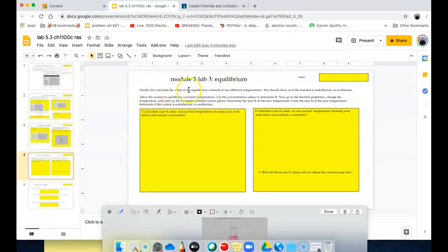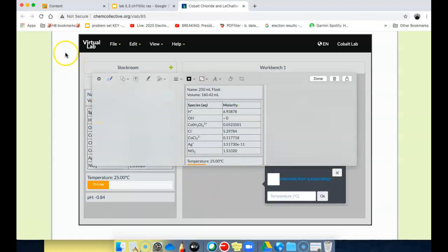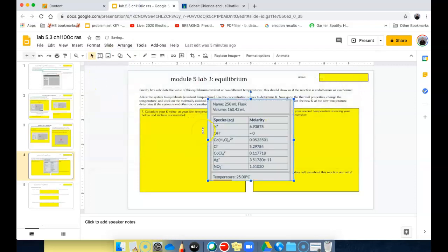Okay, now it says finally, let's calculate the value of the equilibrium constant at two different temperatures. This should show if it's endothermic or exothermic. Allow the system to equilibrate. I think it has by now. Use the concentration values to determine K. Concentration values, oh, they're right here. So I think I will make a copy of those. There. And there it is. And I think I will put those in here just so I know.